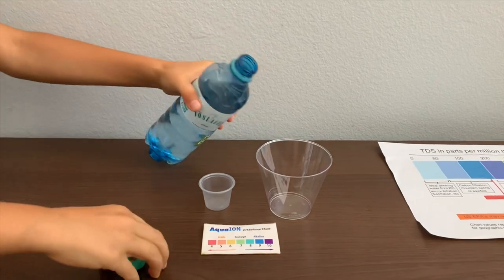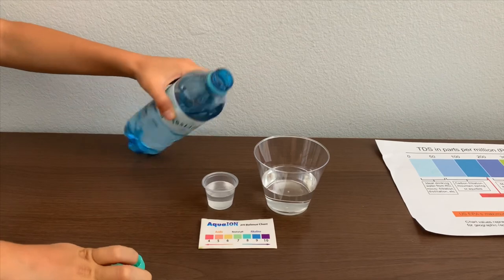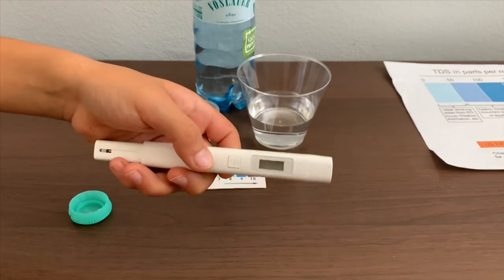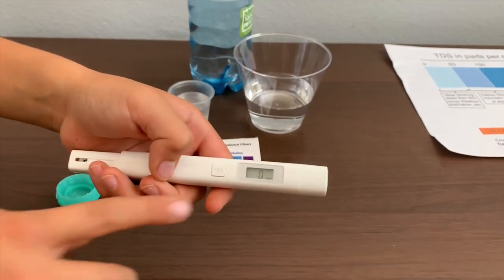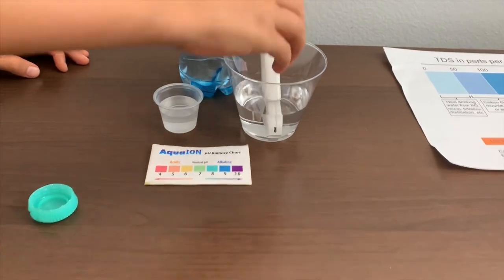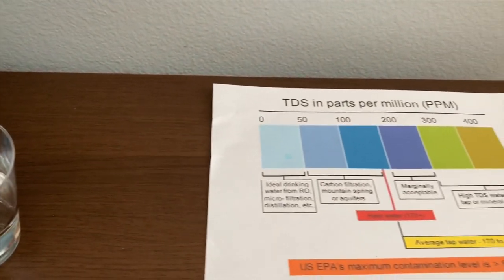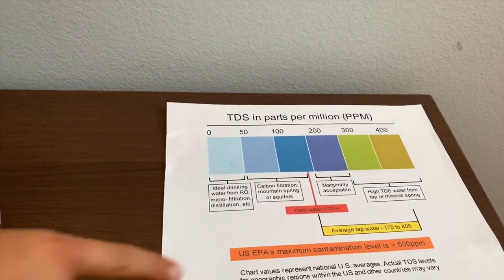Let's pour some water in. First, let's test the pH and TDS levels. If you want to buy this TDS Tester, check the link down below. Turn on the TDS Tester, make sure it says 0 and put it in. 412 — that has high mineral contents.